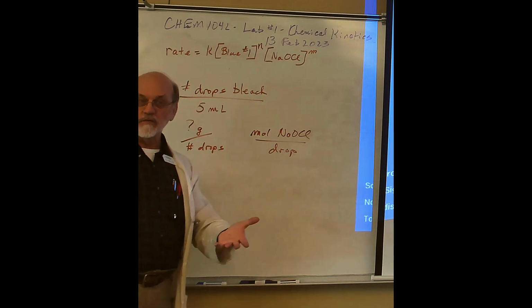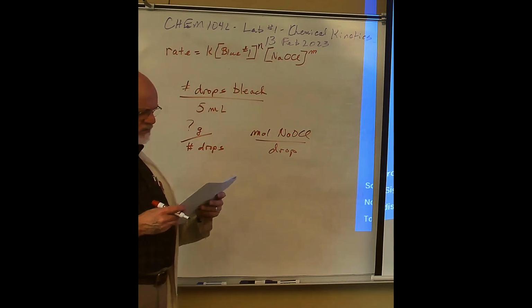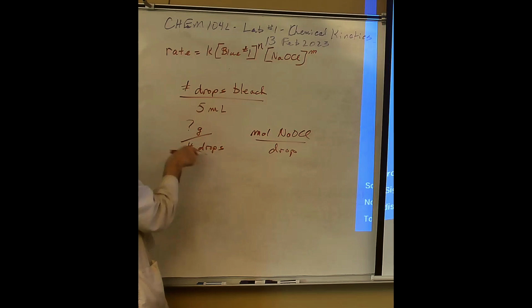And then for the total volume, you also need to know the mass per drop, and you also need to know the milliliters per drop.